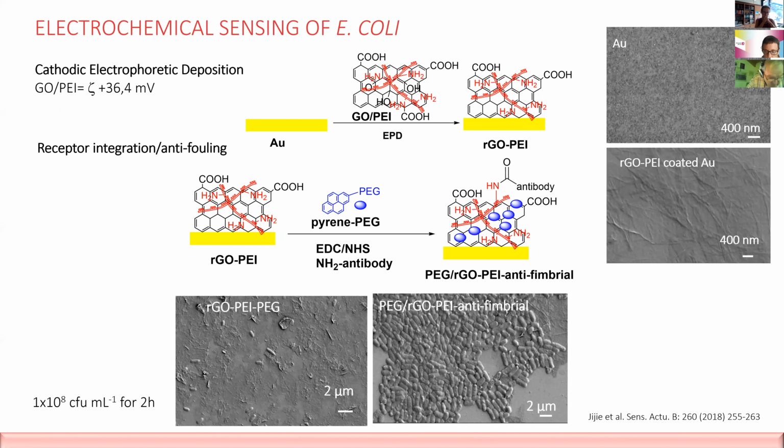If you look at these SEM images, you see that bacteria can actually stick, but we needed to make sure that bacteria stick specifically, and that we get rid of background current. We had to use some surface chemistry approaches. The first was putting a pyrene PEG unit on it. This is a compound synthesized in our laboratory, because we know pyrene ligands stick very nicely to graphene structures. And the length of the PEG, which in our case is between 6 and 12, really hinders non-specific fouling.